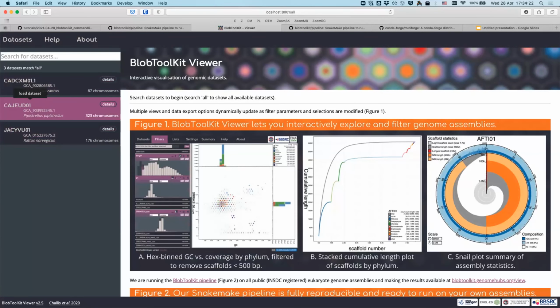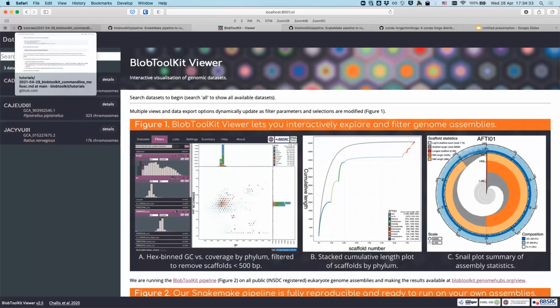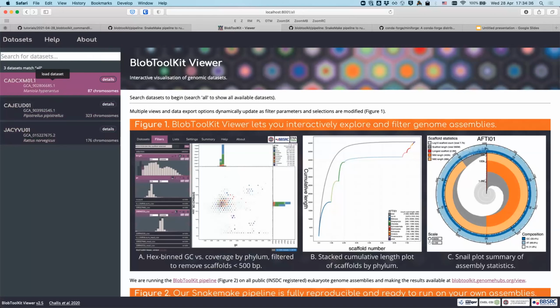Is that right? No, I see only 1. Yeah, you should see only 1. I'm seeing 3 because I had 3 directories over there. Yeah, cool. Wonderful. Aurelian, wonderful. Yeah, but it works. Perfect. Excellent. I'm so glad. Live demos are always stressful.